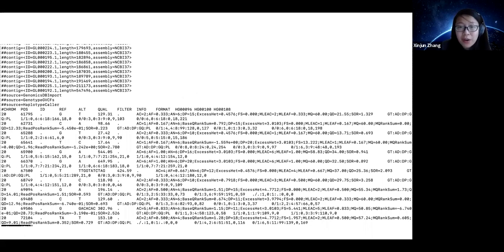Now, once you obtain this file, we technically finished GATK for variant calling. This raw VCF is technically all we need, but not really. We want to do more sanity checks, quality filtering, and more refinement so that this VCF is actually ready for our downstream analysis. So this is a raw output. You definitely should save this file. Usually VCFs are not that big unless you have a huge population. You want to save this file permanently, and whatever filtering you do is based on this file.